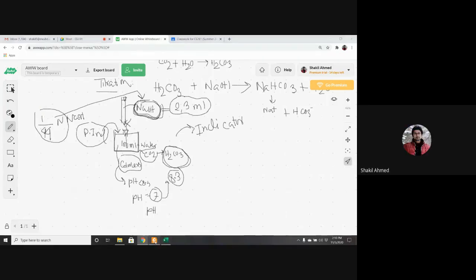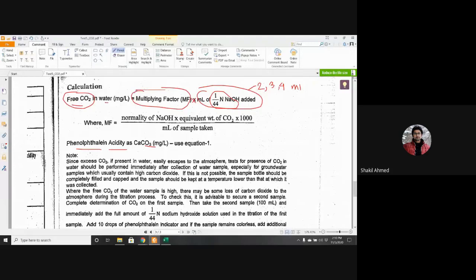Normality. Yes, sir. And the multiplying factor. What is the multiplying factor? The multiplying factor is the normality of sodium hydroxide. What is this, guys? Normality of sodium hydroxide is 1 by 44, right? Yes, sir. 1 by 44.